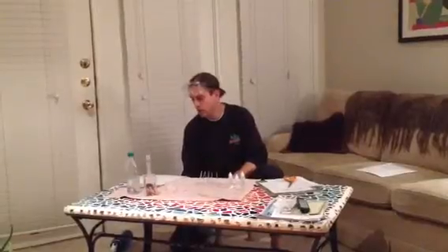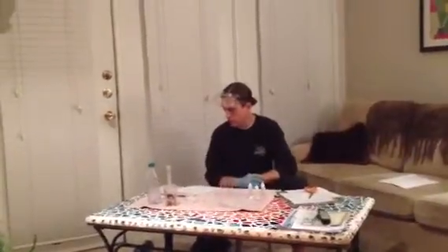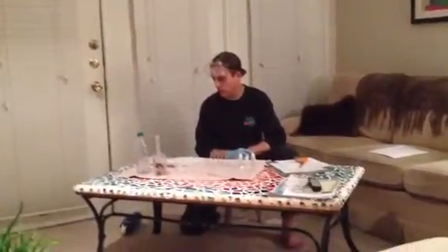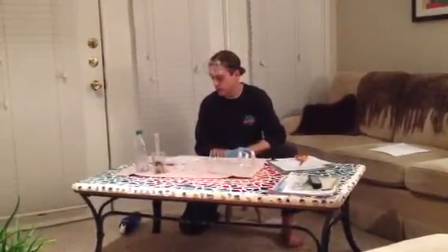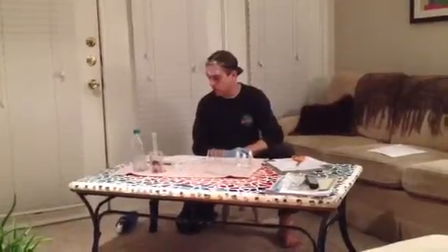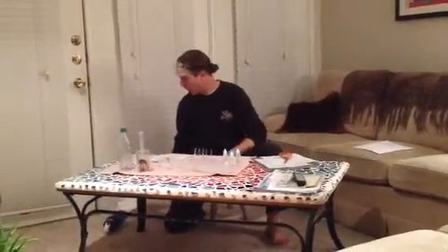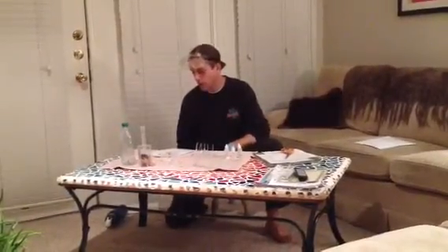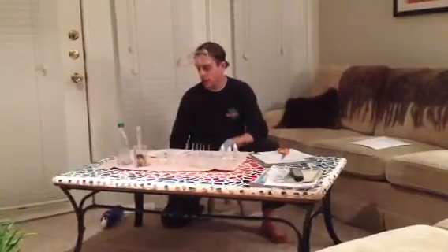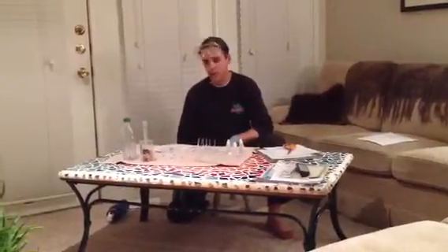This lab discusses qualitative anion tests, and tonight I will be given the opportunity to identify commonly occurring anions and study some of the reactions used for their identification. I'll also be using precipitation reactions and evolution of gas to identify anions. My objectives for this experiment are to identify some commonly occurring anions and study some of the reactions used for their identification.